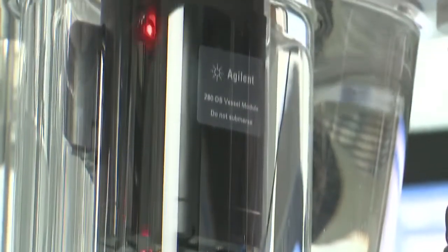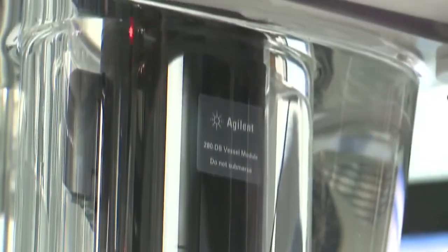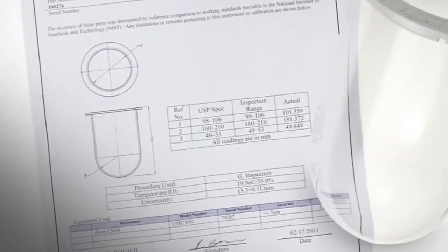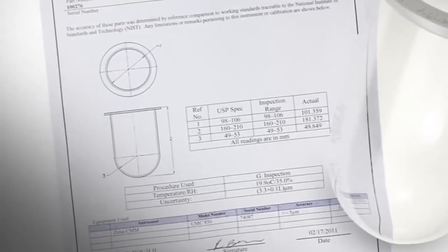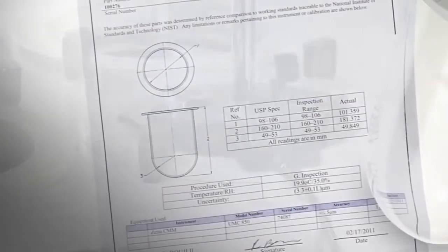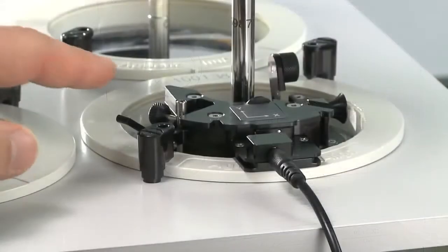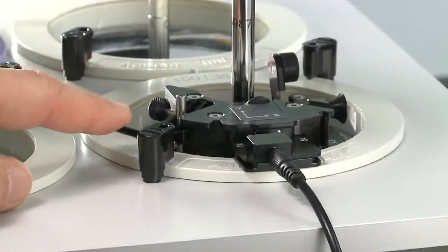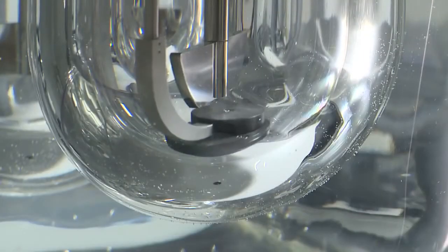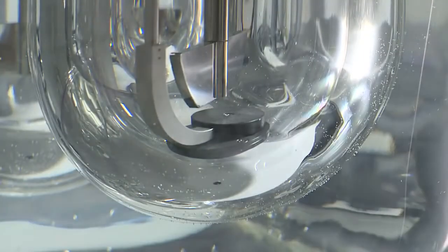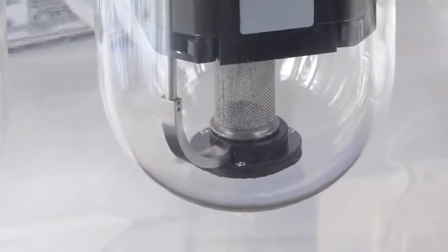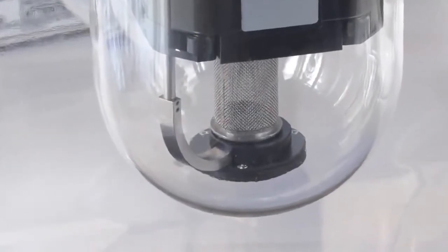Using innovative sensors and exclusive algorithms, the 280DS calculates critical parameters such as vessel verticality and vessel plate level. The integrated height arm precisely locates the lowest position within the vessel and accurately determines all basket or paddle height measurements.